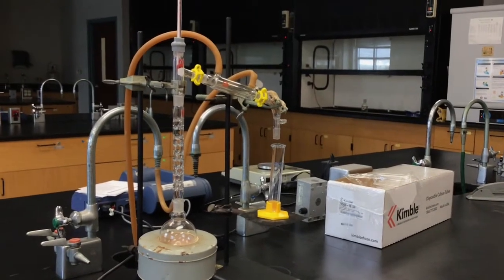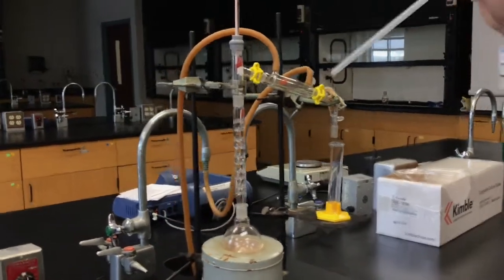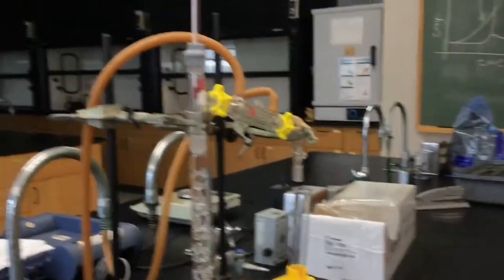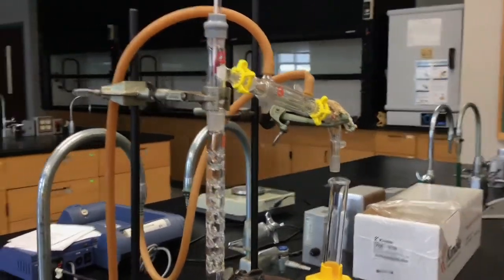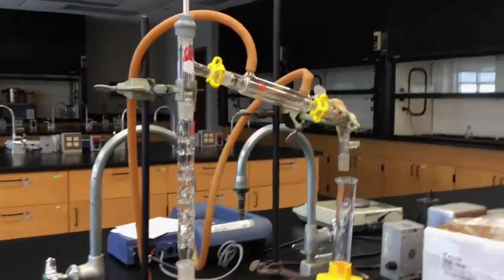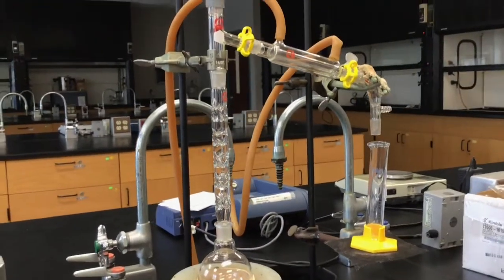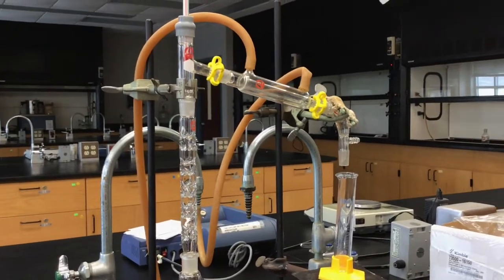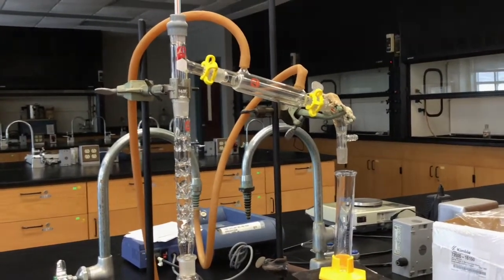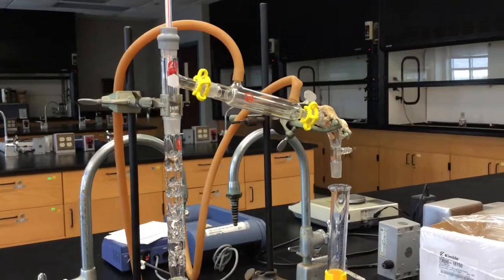Alright. The last thing about this is there's one missing Keck Clip. These are called Keck Clips. These are the pieces that hold the thing together and you need to have them on there to ensure you have good closure. Which will be one of the things that Dr. Hamilton or the TAs will check because you have to make sure that it's closed or you'll lose product. The Keck Clips, the sides you need are the yellow or the caramel colored ones and we can provide them or show them where you are. You don't need the red ones. The red ones are too big for this size of apparatus.